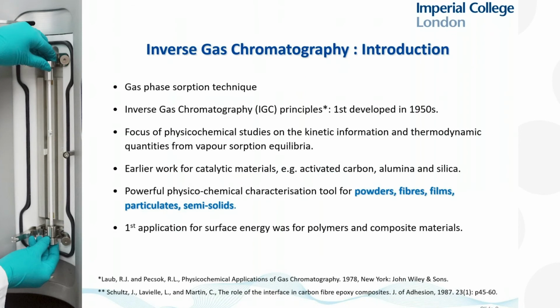To start, a little bit of introduction to inverse gas chromatography. It might seem like a new technique. It isn't. It has been around for a very long period of time and was originally invented for characterizing polymers and composites, and also catalysts and adsorbents, going back into the 1950s, 1960s. But in recent years, we've also discovered that it can be very effective for characterizing particulate materials, including pharmaceutical solids. And today's examples are taken from work we've done over the last few years in characterizing pharmaceutical solid state materials.